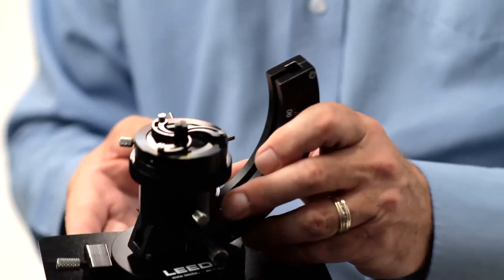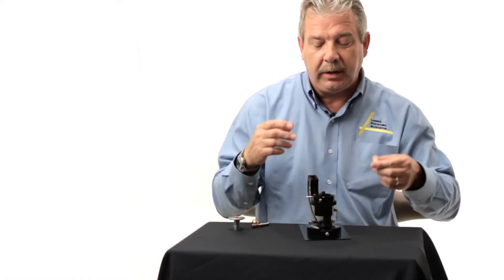What I mean by that is first of all we were looking for a way to make it easy for the examiner to interface with the sample holder.